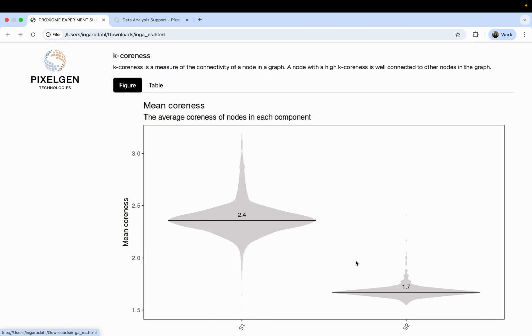We can also look at the colocalization, which includes the scores between different proteins, but it does also include the clustering here on the diagonal. I will zoom out a bit so we can see the whole heat map. So these heat maps only include the top 40 markers based on the proximity scores, and each marker has to be present at least 25% in the sample.